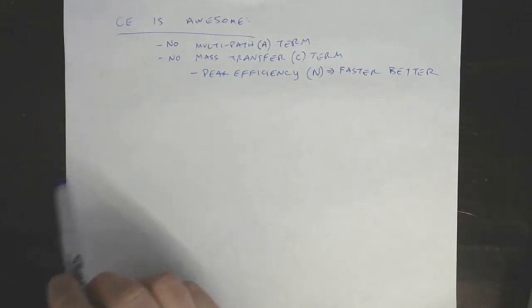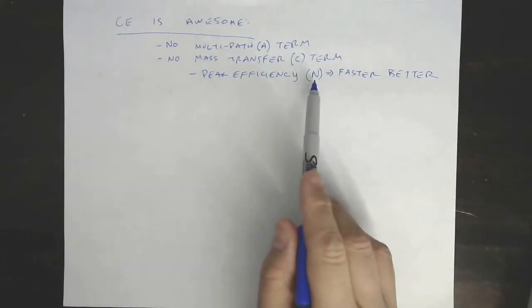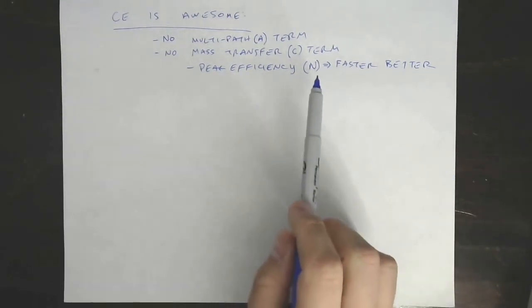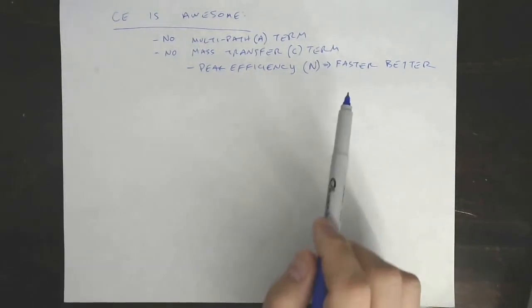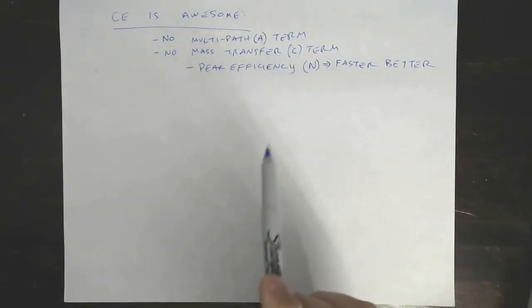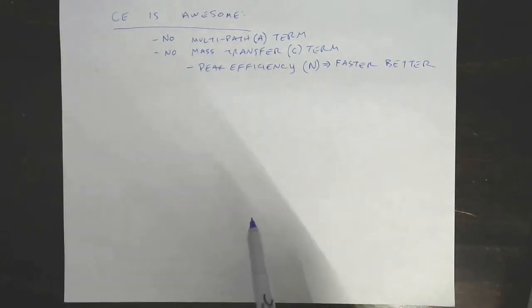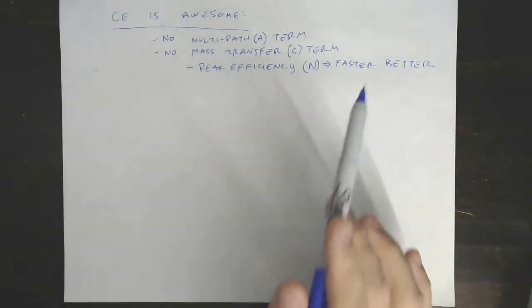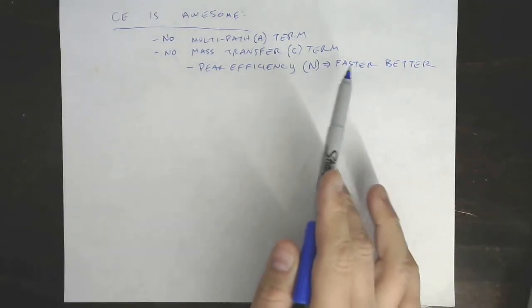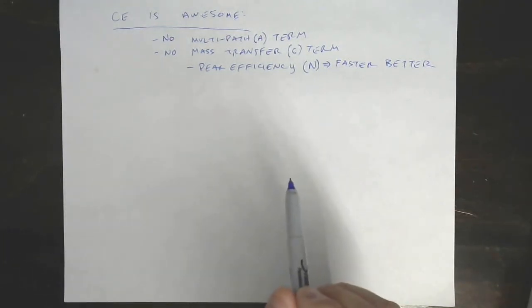In traditional chromatography, we have said that we make a sacrifice. We let N get poorer. We let H get larger, if you want to think about it that way, by going faster, because we can get a faster result and good enough resolution from the compromised peak efficiency. But in CE, we don't have to make that compromise. In CE, we just go as fast as we can, and if we go as fast as we can, we get the best peak efficiency we possibly can.